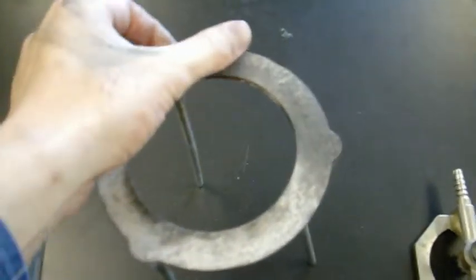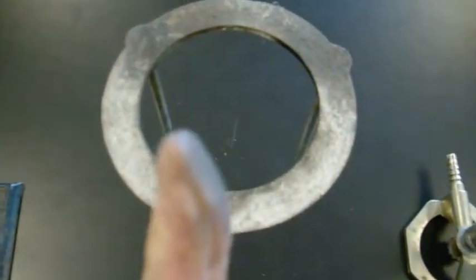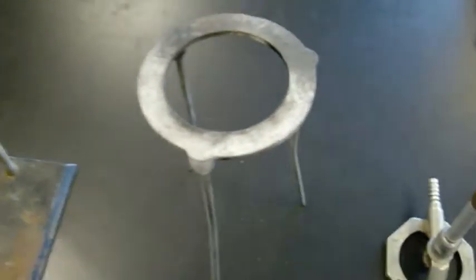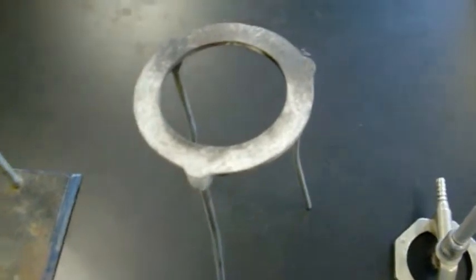Be careful, the tripod will have a little bit of soot on it and so will the copper mesh. Don't worry, it's harmless, but it will get your hands a little dirty. You'll need to wash your hands after the lab.